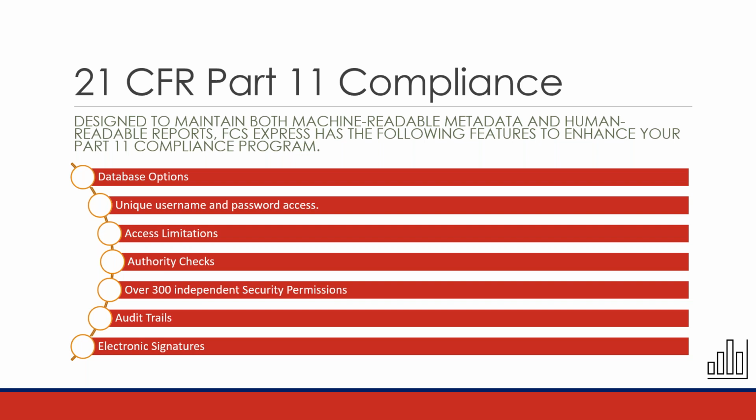Now, many of our customers, many of the people on this call actually, are customers of our security package. You have security enabled as part of the license that you use on a daily basis. And what that security package is, it's a way to meet 21 CFR Part 11 compliance in your analytical needs. So FCS Express has a number of different features available as part of this 21 CFR Part 11 compliance, where we provide different database options, whether you're using SQL, or if you'd rather use a local database.